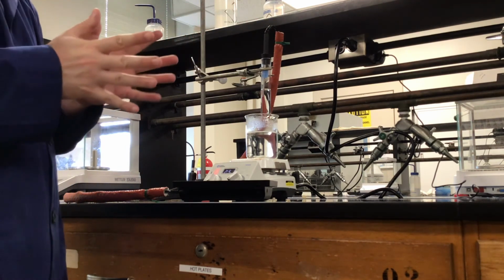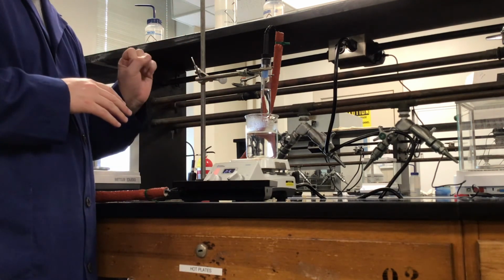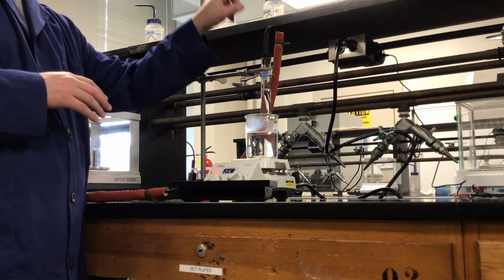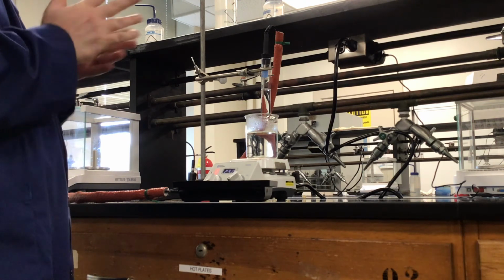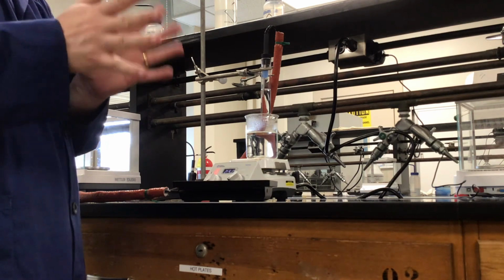If you're too careless, that's probably the one big safety hazard this lab could have: if you heat this too much and don't pay attention, you can make a small jet stream of boiling ethanol coming out of the other hole that's open in that stopper. You'd probably have to have a decent amount of negligence for that to happen, but it's not impossible. So I want people to be aware and pay attention.